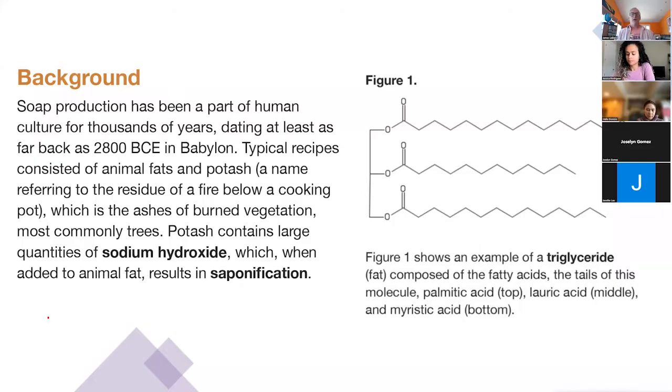On the right here is called a triglyceride. Hopefully some people have read this already. What does the glyceride refer to? Why do we call it a triglyceride?